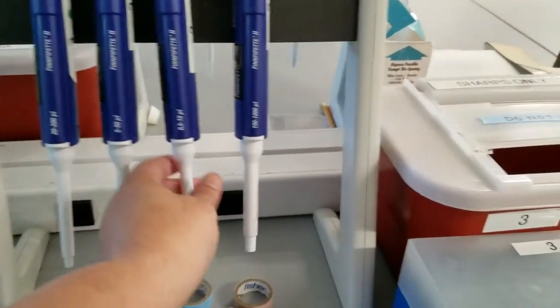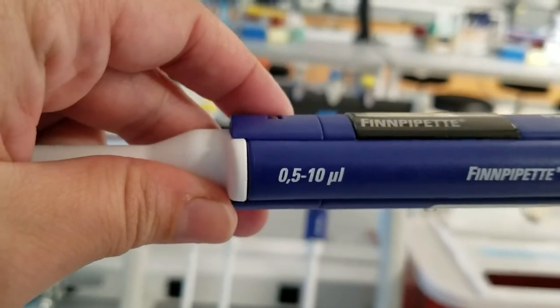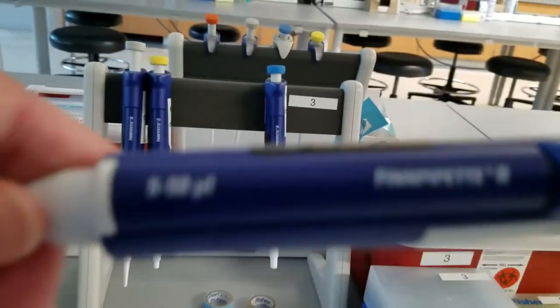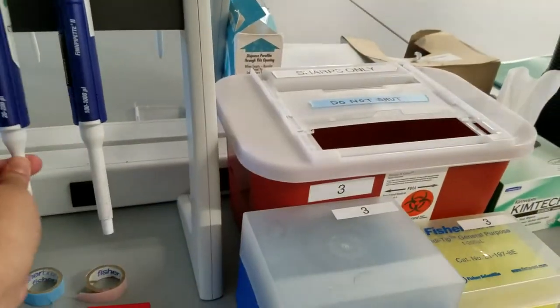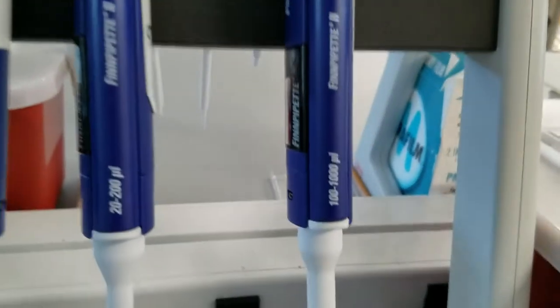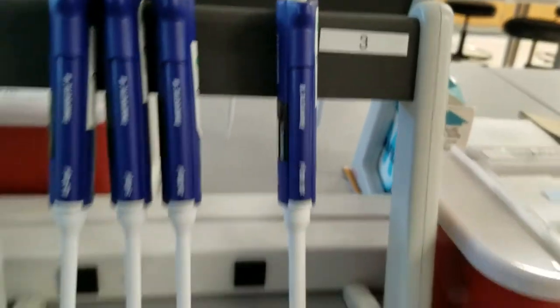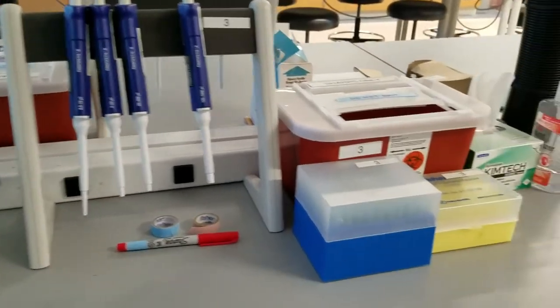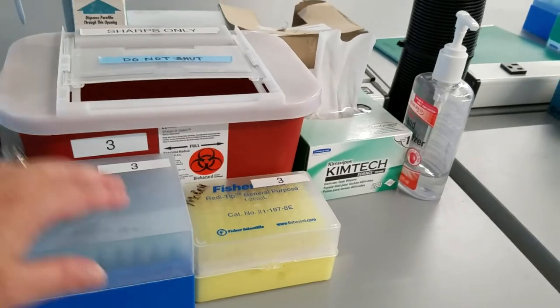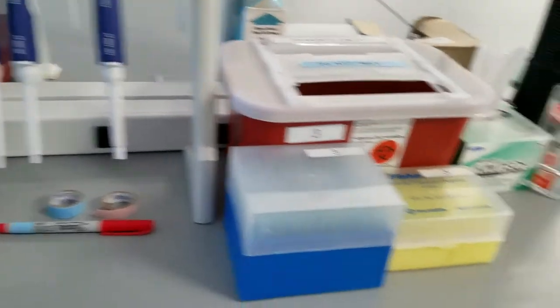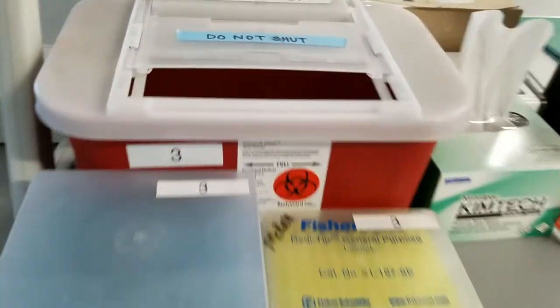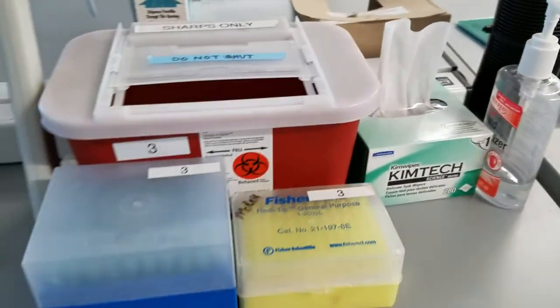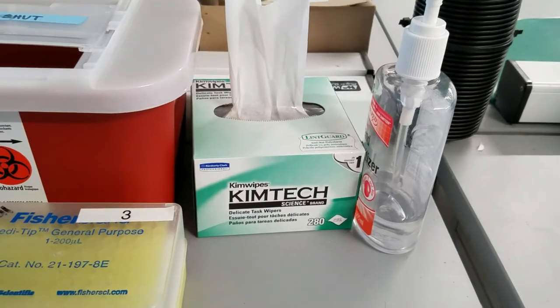We also have a set of pipettes. The pipettes range from small which go from 0.5 to 10 microliters - so very small volumes - and then you have ones that go from 5 to 50 microliters, others that go from 20 to 200 microliters, and finally we have 100 to 1000 microliter pipettes. Using these we can pipette really tiny volumes all the way up to 1000 microliters or 1 ml. The blue tips go on the blue pipette or p1000, the yellow tips go on p200, and the orange one the p50. The tips are always discarded in this hard biohazard bin for sharps only.